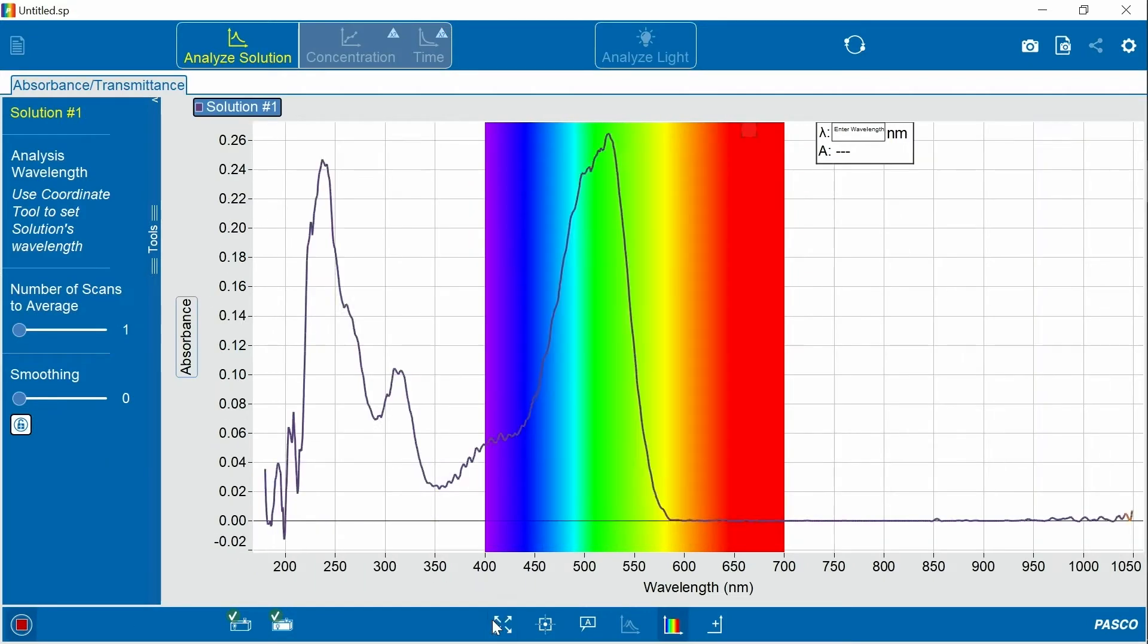I'm going to scale my data and increase the number of scans to average to improve the display. There we go. And as you can see, green wavelengths are highly absorbed by the solution, but red is not.